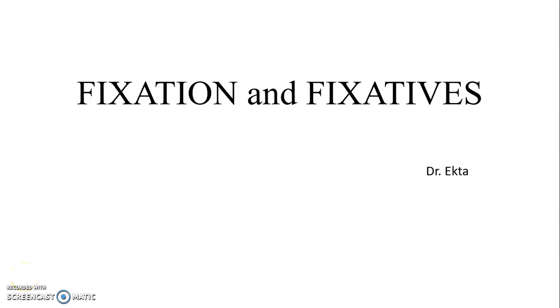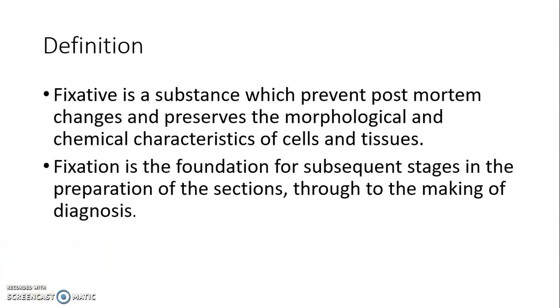Hello everyone. We are going to study fixation and fixatives in histopathology. So a fixative is a substance which prevents post-mortem changes and preserves the morphological and chemical characteristics of cells and tissues. And fixation is the foundation for subsequent stages in the preparation of the sections through to the making of a diagnosis.